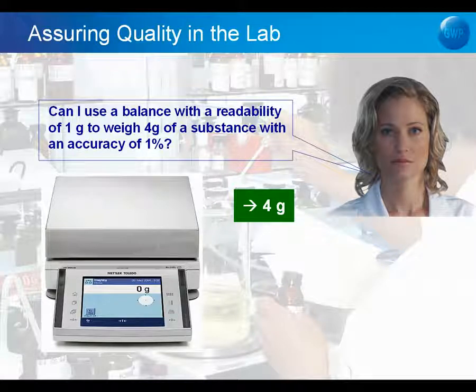Let us start with an example. Let's assume the user wants to weigh 4 grams of a substance with an accuracy of 1%. This means that he wants to weigh 4 grams of his substance with a maximum deviation of plus or minus 0.04 grams. Could the user thus select a balance with a readability of 1 gram to weigh 4 grams with an accuracy of 1%?